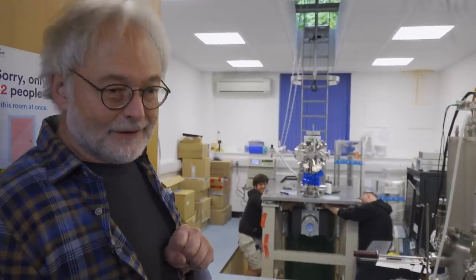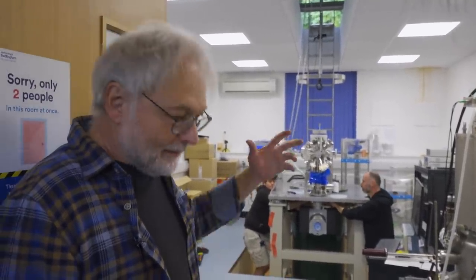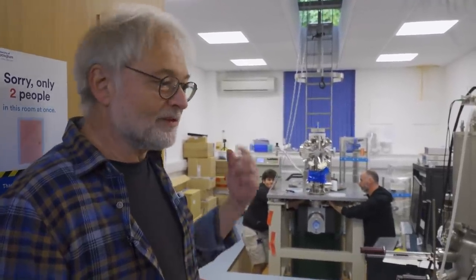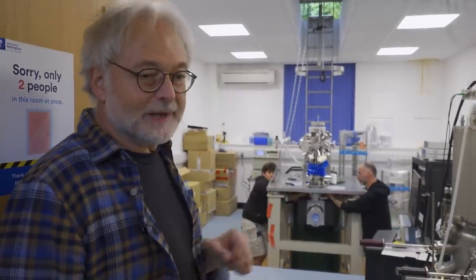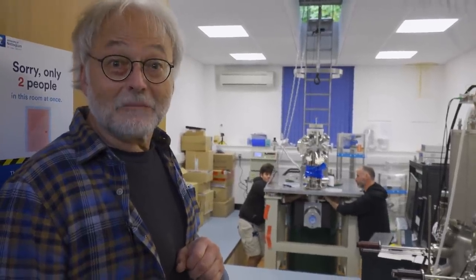we will pump it down and leak check, and the next step will be to go for UHV with the bakeout and everything, and before that do some tests with the STM, and eventually after the bakeout cool the thing down, and then the great hour comes.